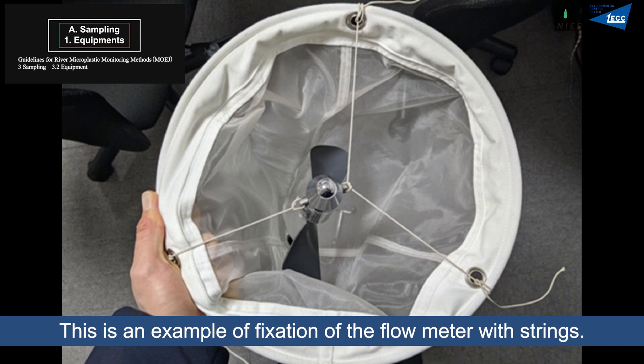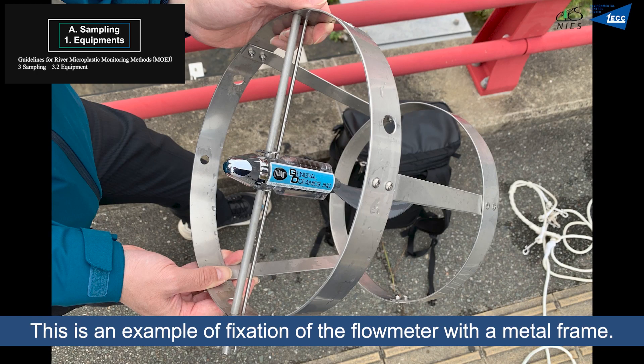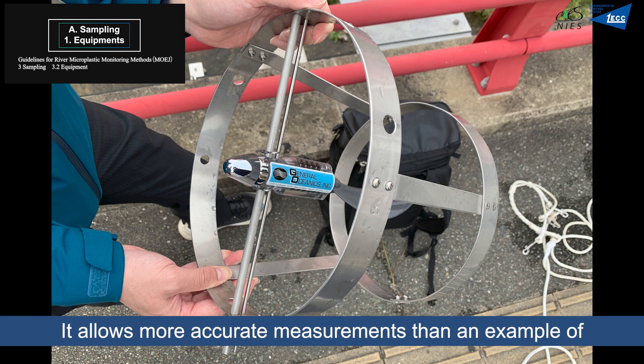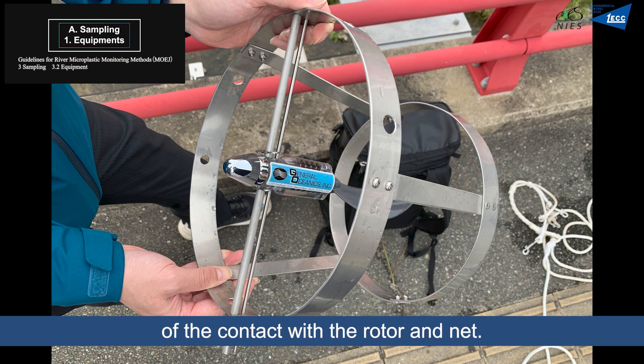This is an example of fixation of the flowmeter with strings. A flowmeter is installed at the center of the net frame. This is an example of fixation of the flowmeter with a metal frame. It allows more accurate measurements than fixation with strings due to greater stability and a lower possibility of contact between the rotor and the net.